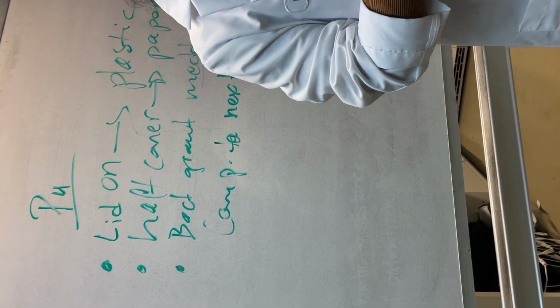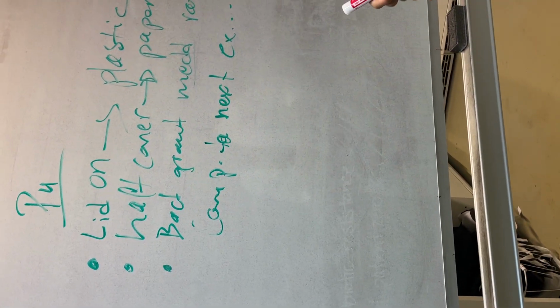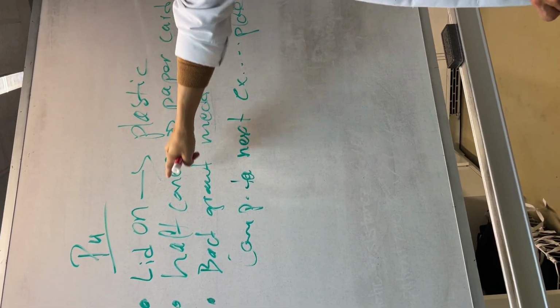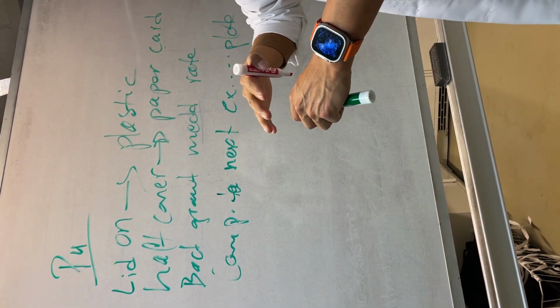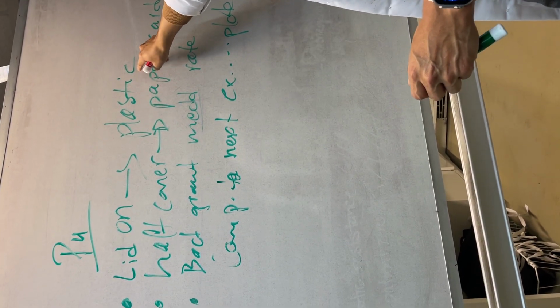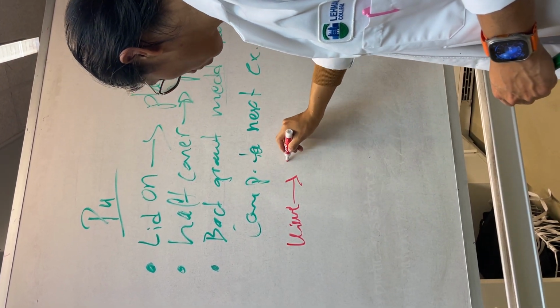So now comes the part of interpretation. What does this mean? It means the following. We know that bacteria, when covered with plastic, when the UV light is coming through, it's coming with a lot of force. But as it passes through the plastic, the wavelength weakens.